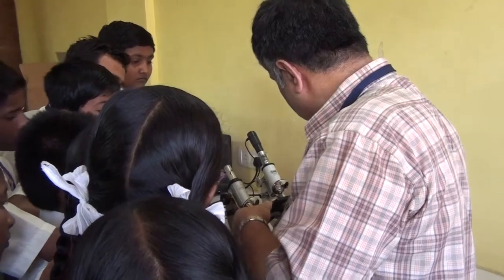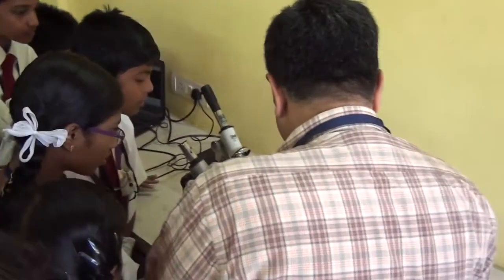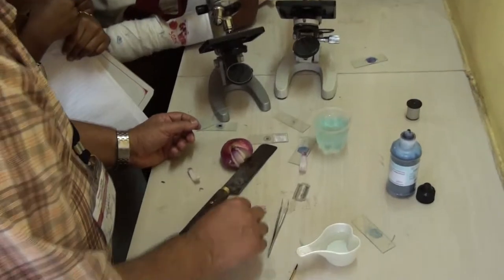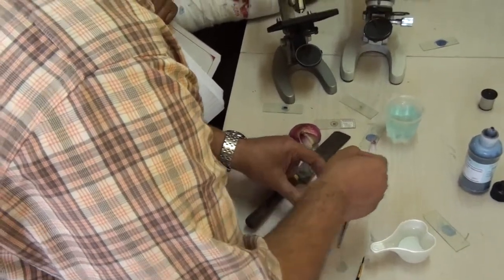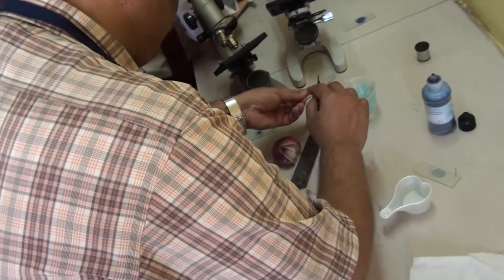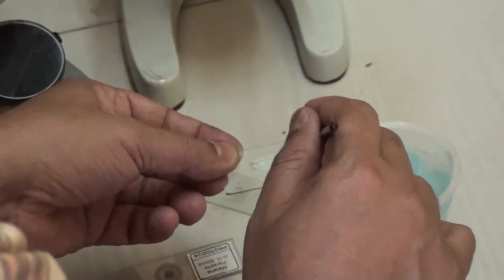Now let us look at some object using this. If you take it out nicely, there is one here. Can you see? Yes. You do this, take it out, I have one here, and put it on a slide. Spread it out nicely. Let us put it here. That's better. Okay, after that, you take this out. I'm spreading it out. Okay, that is enough for me.